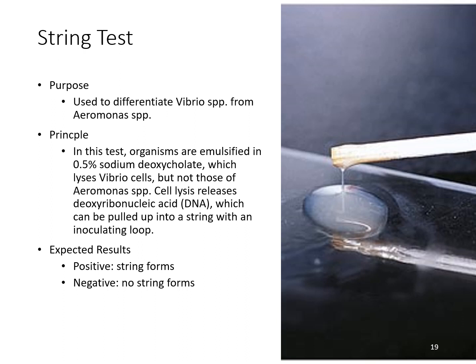If you ever did any sort of like DNA lab in high school, you may have done something like this with strawberries or saliva, where you're trying to do a DNA extraction. And so this would be sort of similar to that particular test method.